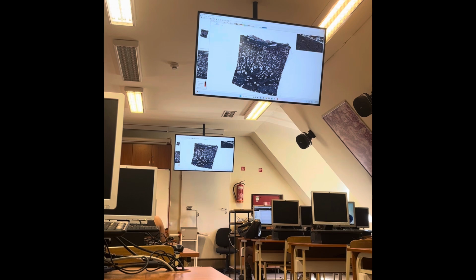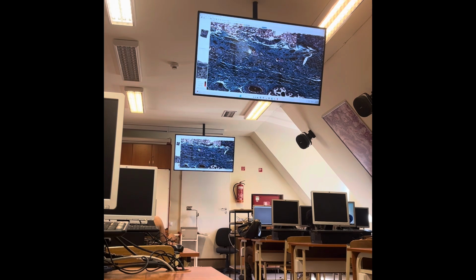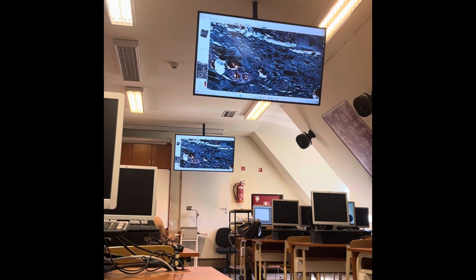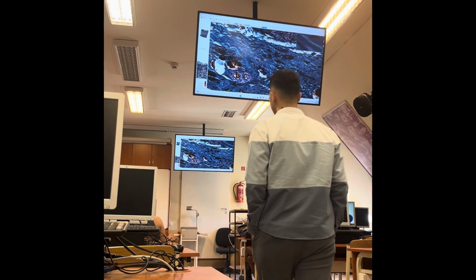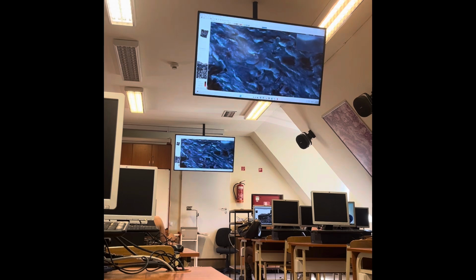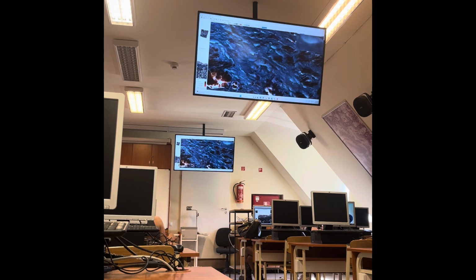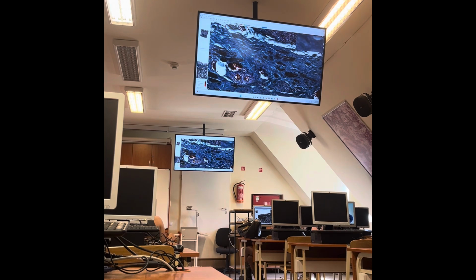If you look at this specimen here, you can see it is oriented differently than the other specimen. The connective tissue capsule is visible here. I come to here and let's identify the colors provided by the Goldner staining. So greenish bluish color. What do you think? What structures are stained in this color? Collagen. It's mostly the collagen what is stained. If you remember the small intestine specimen, also the mucus in the goblet cells was stained in similar color. Okay, so one color.